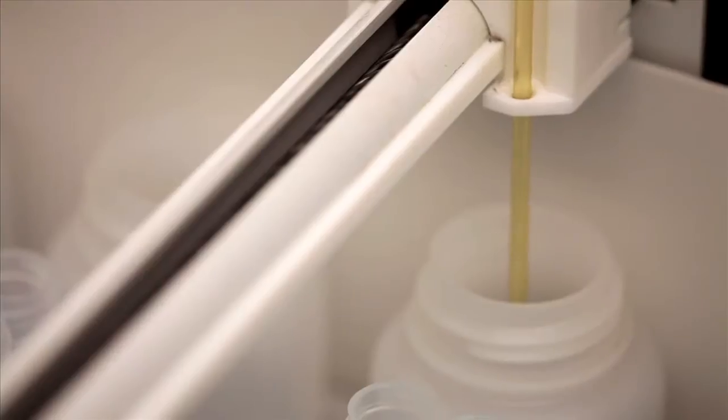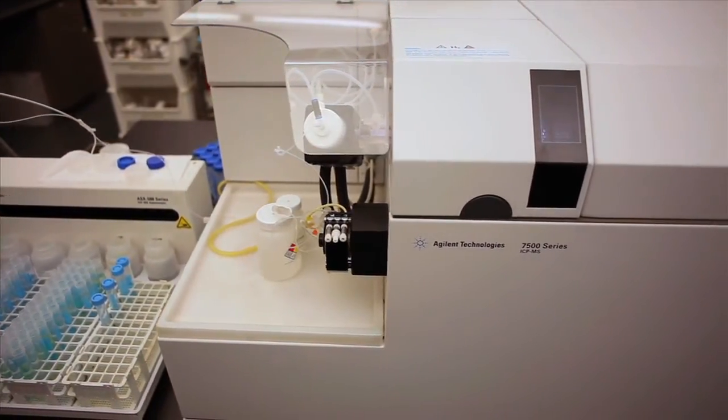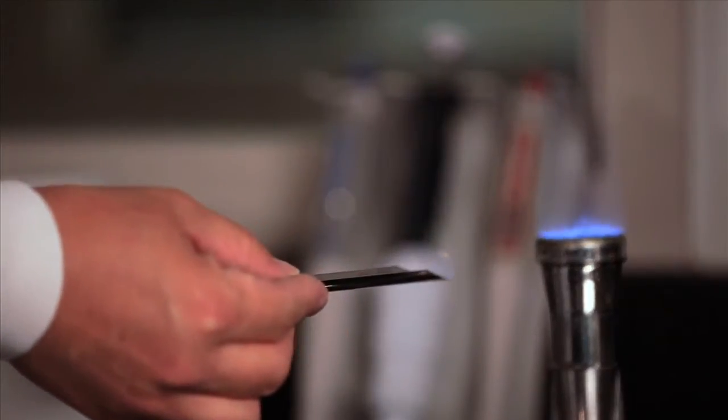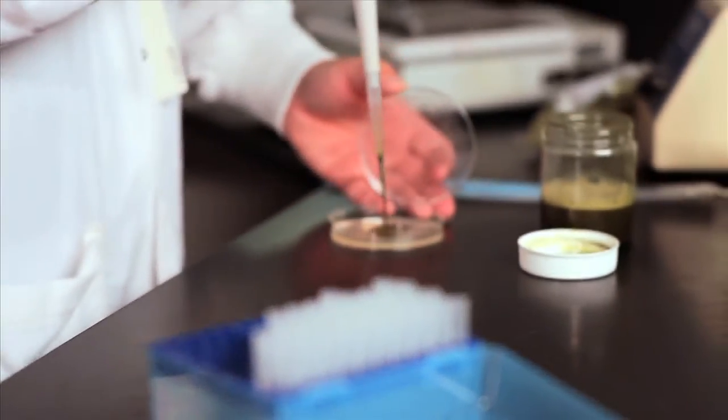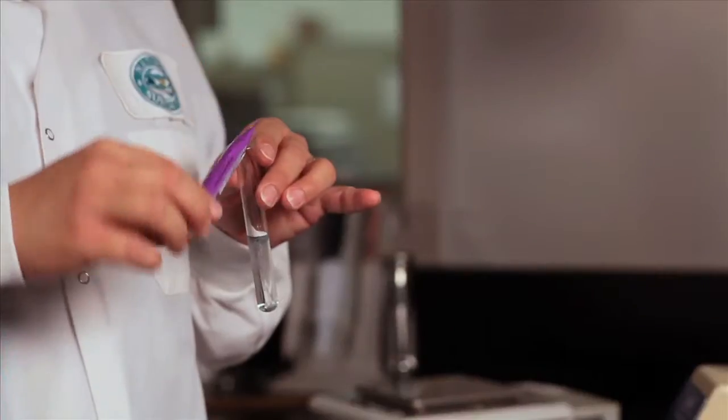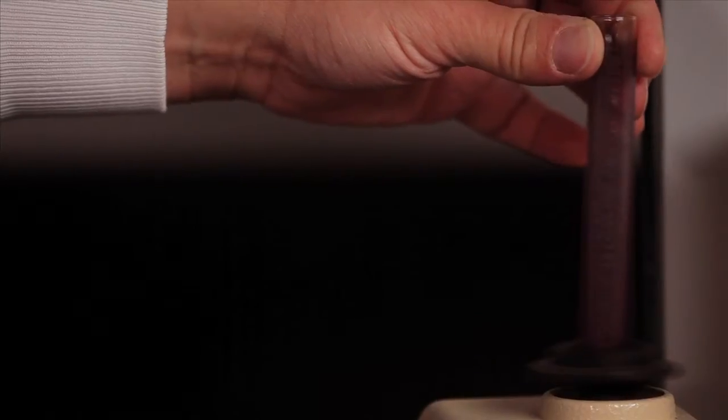But that's not enough. We need to know down to the elemental level what's in our products. This unsuspecting machine is the inductively coupled mass spectrometer. A plasma flame as hot as the sun burns and analyzes the material down to the parts per billion. Though we've taken precautions throughout the production process, we also test all of our materials and finished products here in the micro lab. These tests make sure that no foreign microbes are present in our ingredients or are introduced during manufacturing.